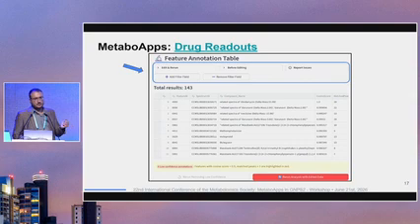So do you mean that all similar-looking metoprolol analogs, methylated, hydroxylated, fluorinated, whatever, are all clustered together as metoprolol? No. In this case, as they are excluded, they are not being considered as metoprolol. But if you include them, then you have that information.